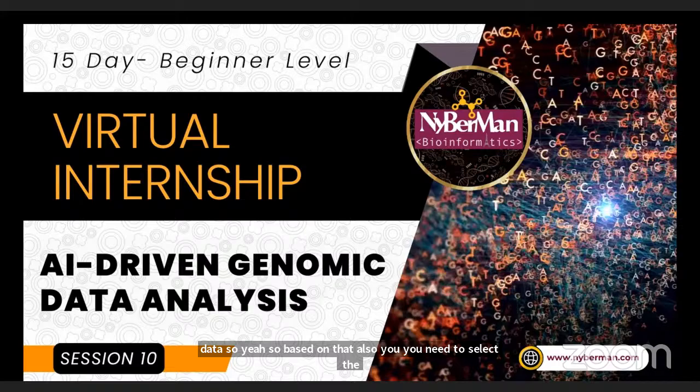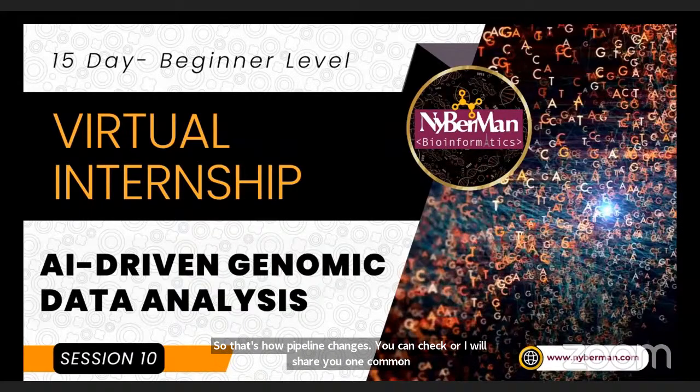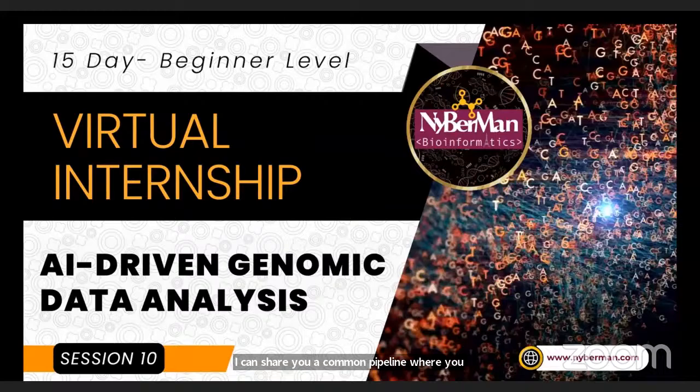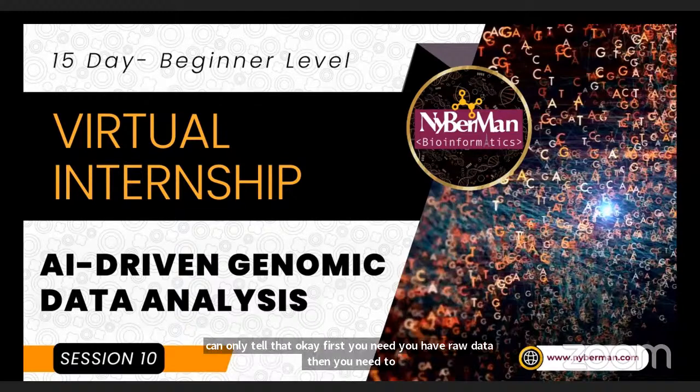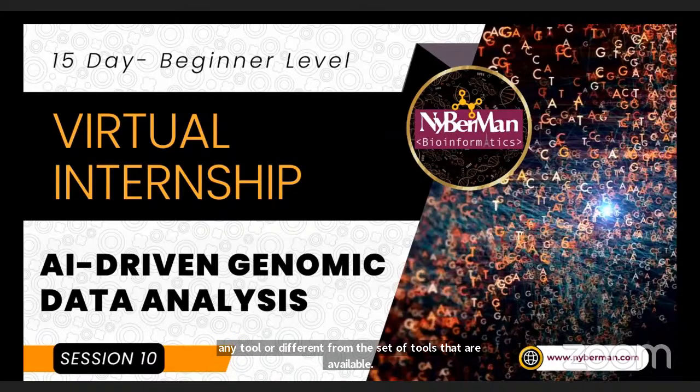I can share you a common pipeline which will not tell you what tools you need to use. It can only tell you that, okay, first you have raw data, then you need to go for trimming of your data and checking the quality, then it will be the alignment and mapping step. So it can theoretically tell you what steps you need to follow. According to the steps, you can select any tool from the set of tools that are available for each step, and then you can perform the analysis.